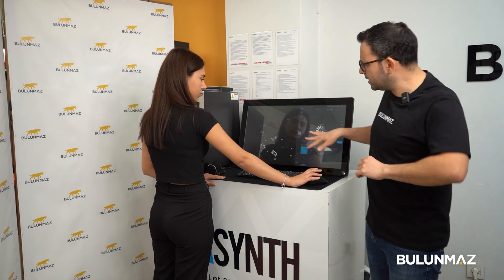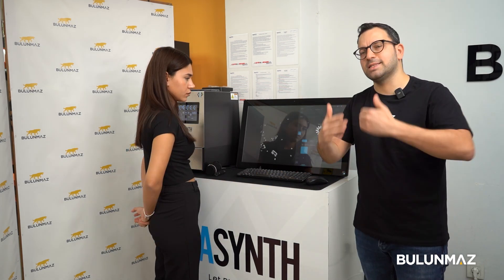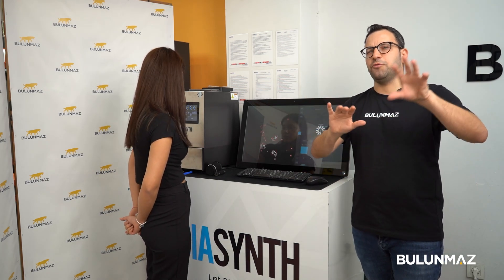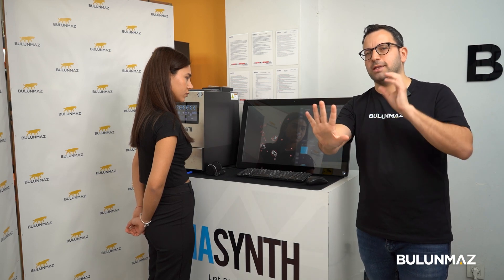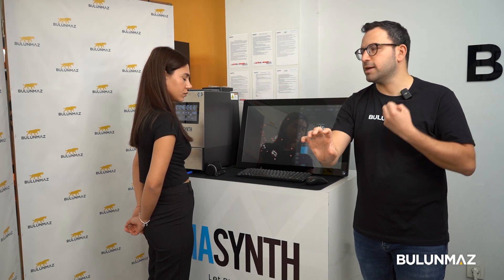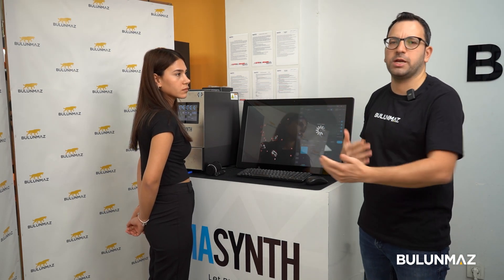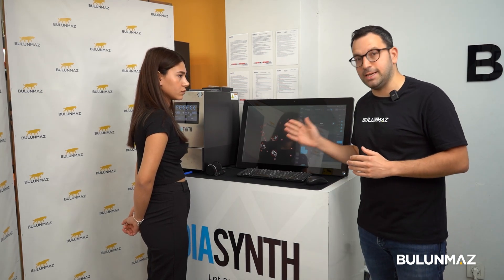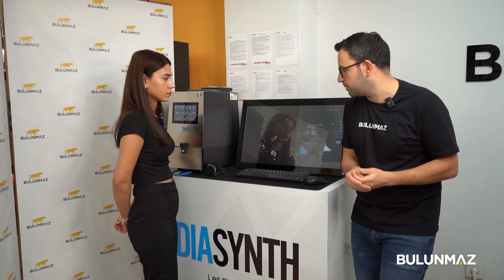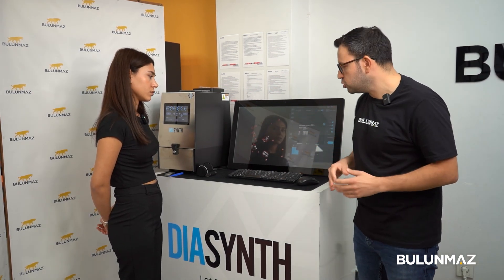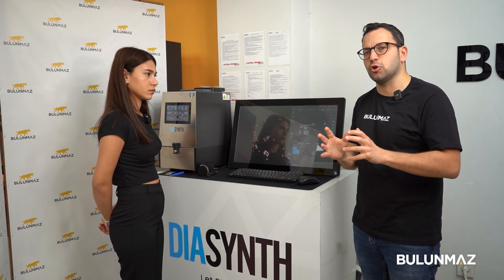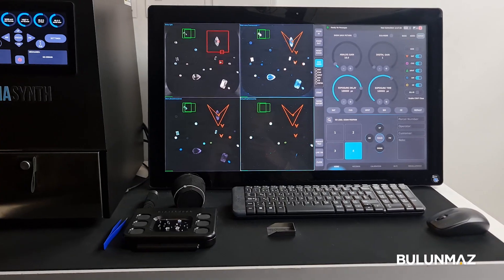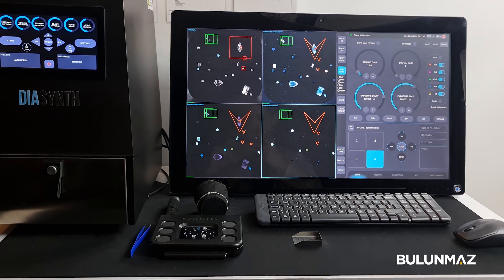When the operation starts, the machine takes a series of photos — usually 16 photos. It groups them: four photos checking the light, four photos checking how the stones react to the light, and four photos for other operations. There are different operation modes; when you contact the sales people of DTP Diatech Pro, they will give you more information. When the machine makes the photos, it analyzes each one and the AI compares them to get every result and give you a final report.